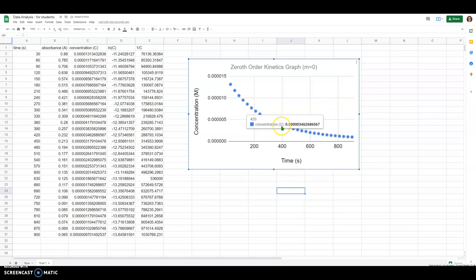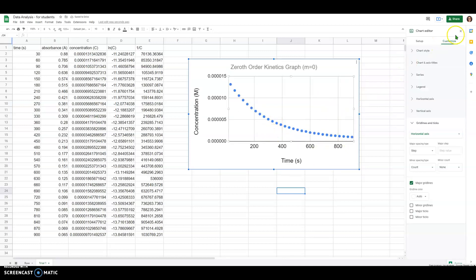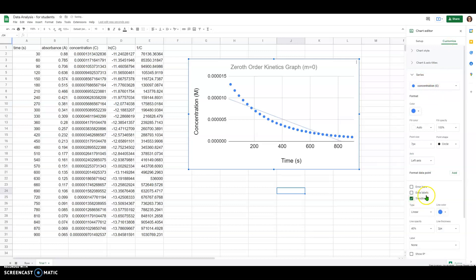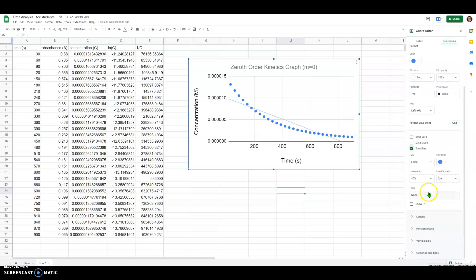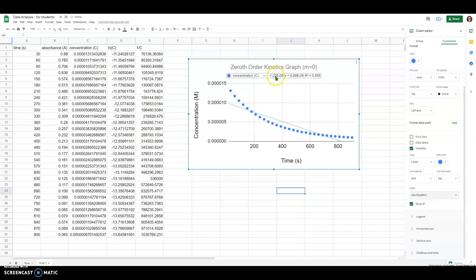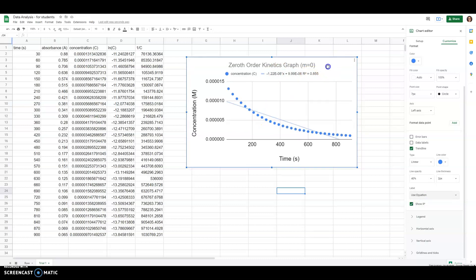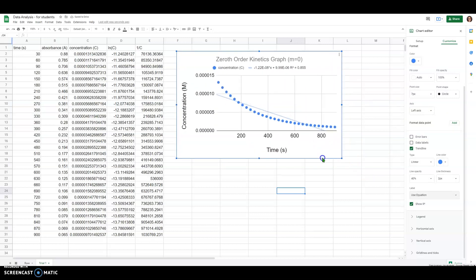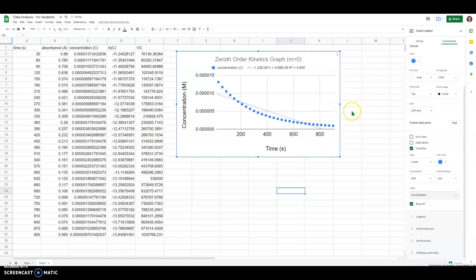The last thing is to add a trend line to this graph. Double-click on the graph, go to Customize, then Series. Under Series in the Customize tab, hit Trendline, then make sure you choose to show the R-squared value and change the label to show the equation. We want to display both the trendline equation and the R-squared value, since those are really important for evaluating these graphs.